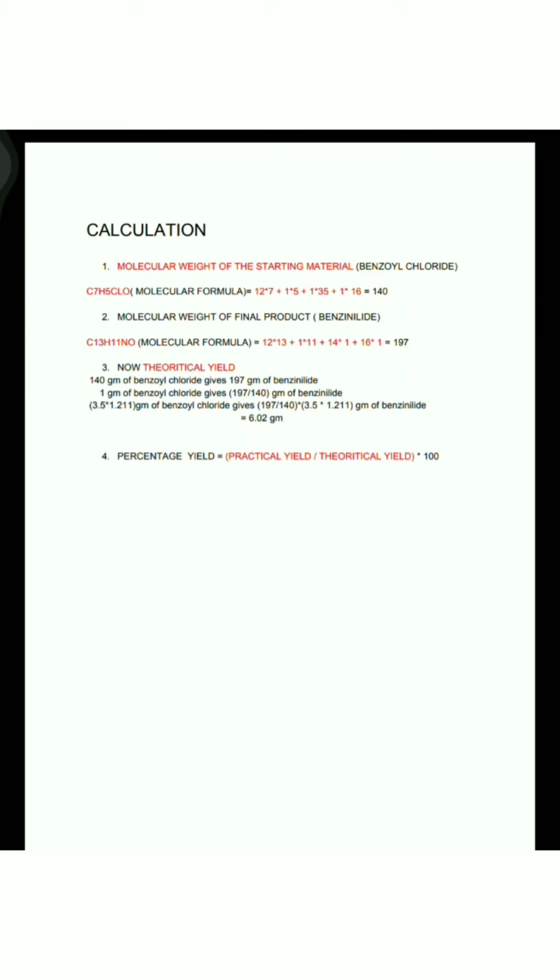Moreover, one more thing we have to do. We cannot do the melting point experiment with the melting point apparatus here. So here we will only note down the melting point from Google. I have already given you the link in the report. You will just have a look at that link and write down the melting point. When the college reopens, we will do the melting point test in the melting point apparatus. Thank you.